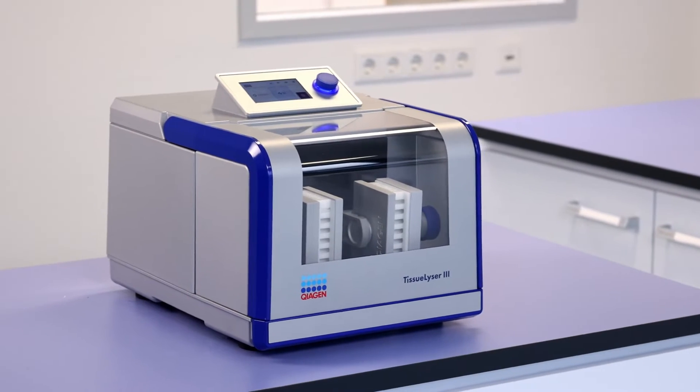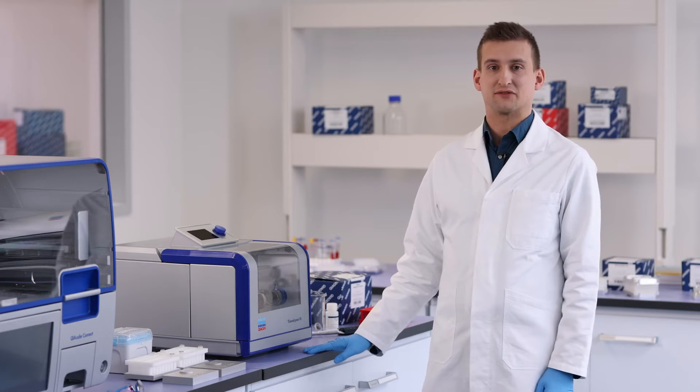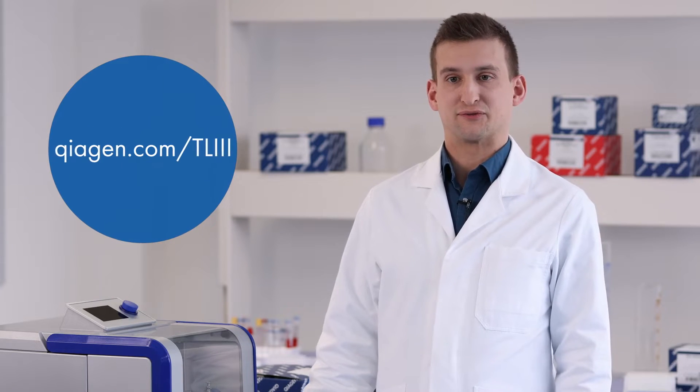The Tissalizer 3 requires a clean, vibration-proof bench with enough space left and right of the instrument for ventilation. Don't forget to remove the transport security locks the first time you use your instrument — for that, refer to the user manual.